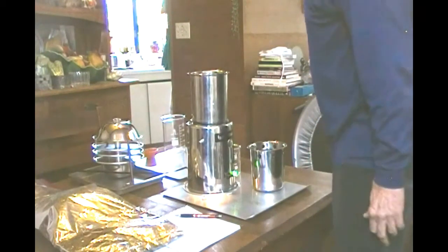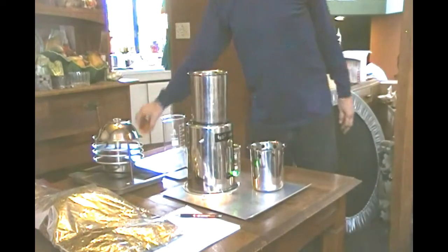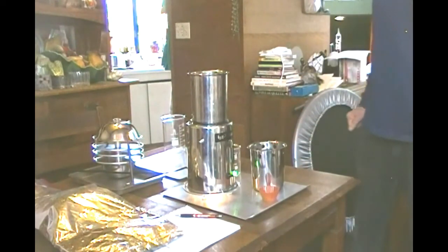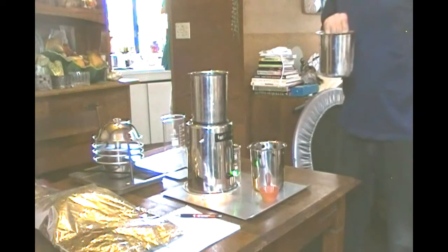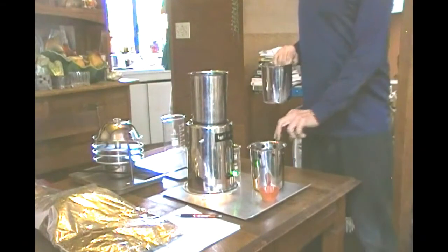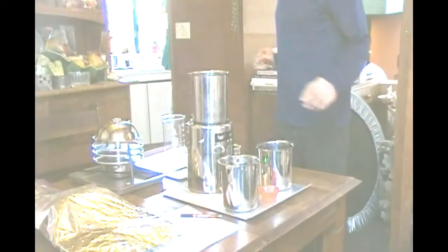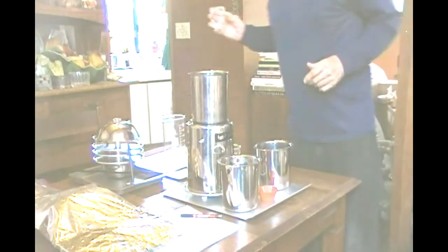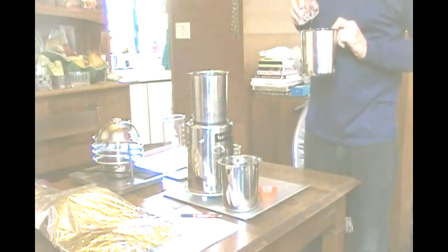So now we're going to do the last step, which enables us to not lose any of the oil and to get the oil out of the processing vessel in a doable manner. Almost all the alcohol is now gone. So we see the oil in there. It's thick and black and gooey. I'm going to add about 25 milliliters of alcohol back to this. Turn off the switch, of course, and we're going to put just enough alcohol in here to redissolve the oil.